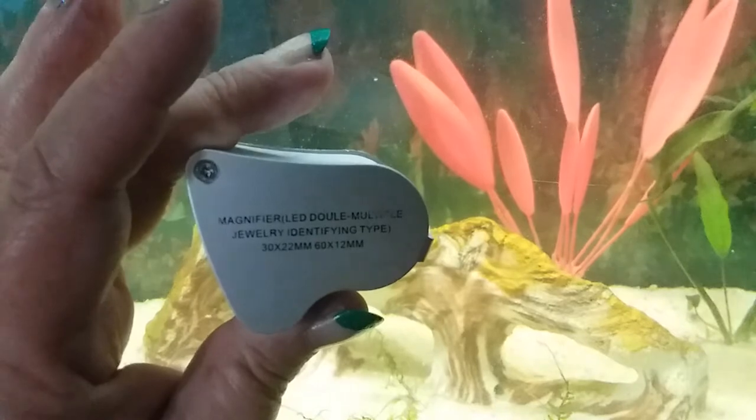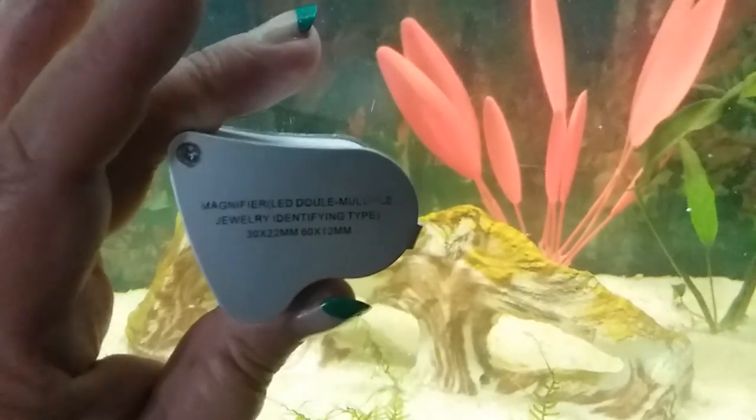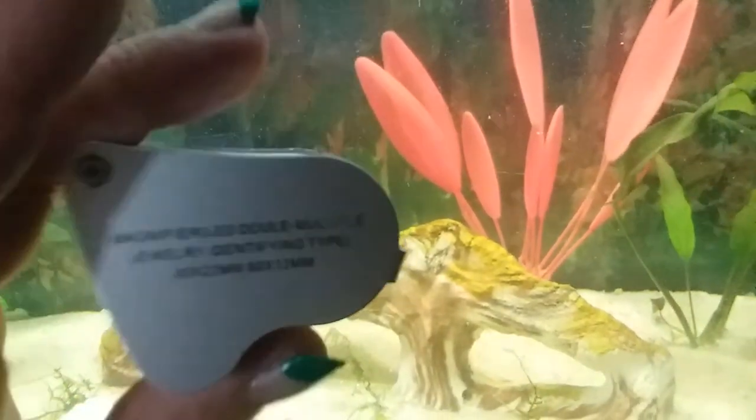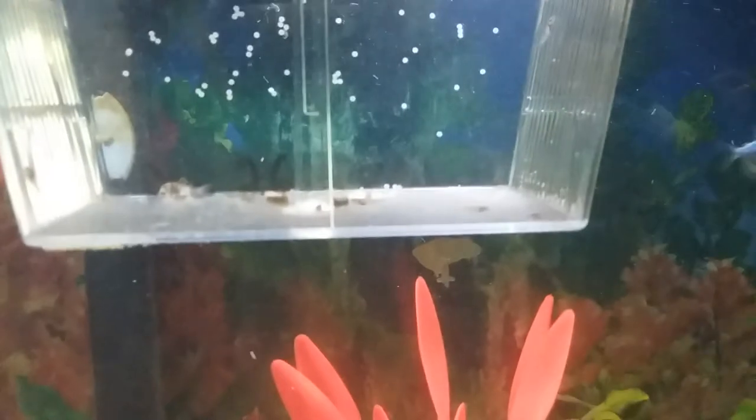30x 22mm and 60x 12mm — I thought it was 12 and 10, but there we go. Anyway, there you have it: a microscopic view of what lives in your tank. And yes, the eggs are still hatching!